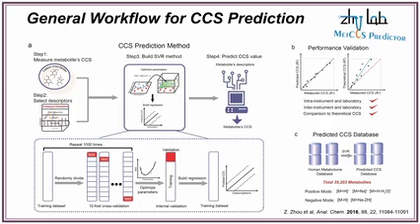And so it's got quite a large collection for metabolites, 35,000. One thing to note is what sort of adducts are included in the database, because this can have some influence on the quality of the answers that you get back. So if your adduct type is not really well represented in the training set, there might be some error there. So this is an online utility.